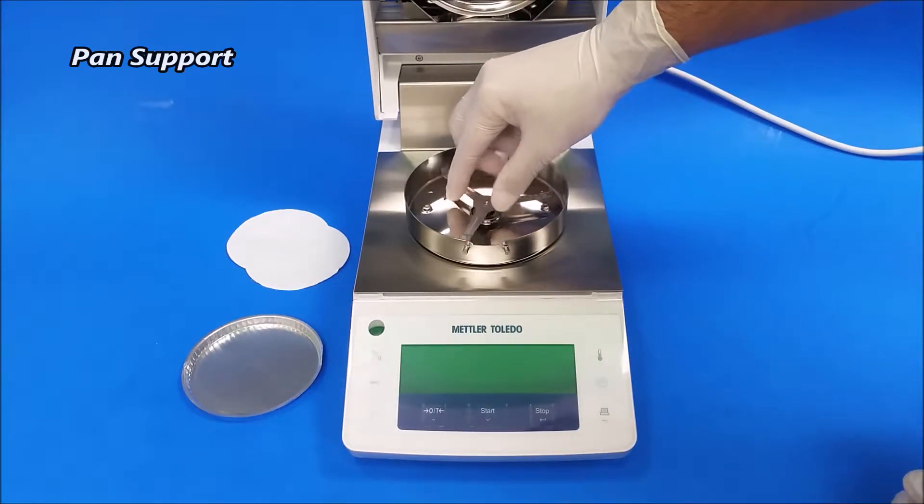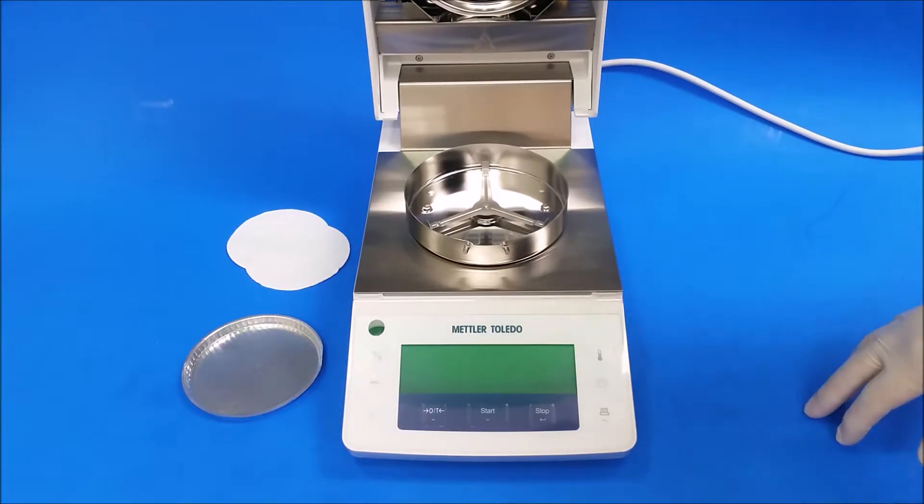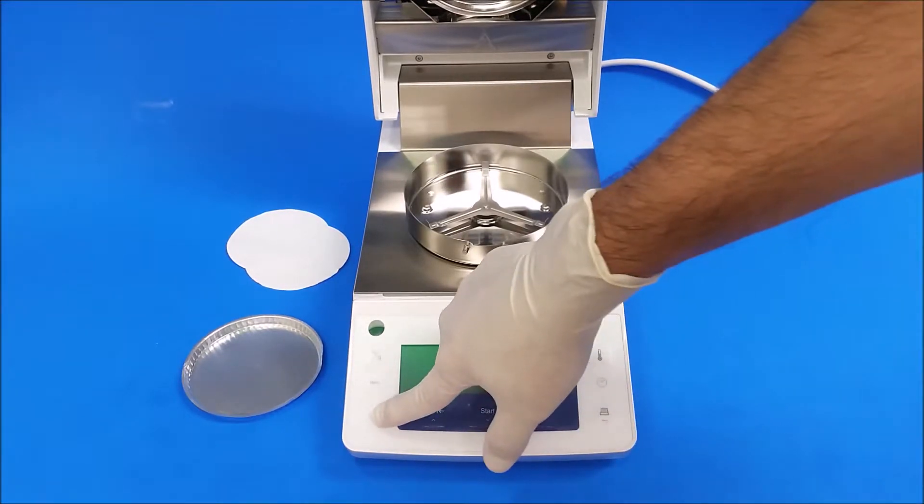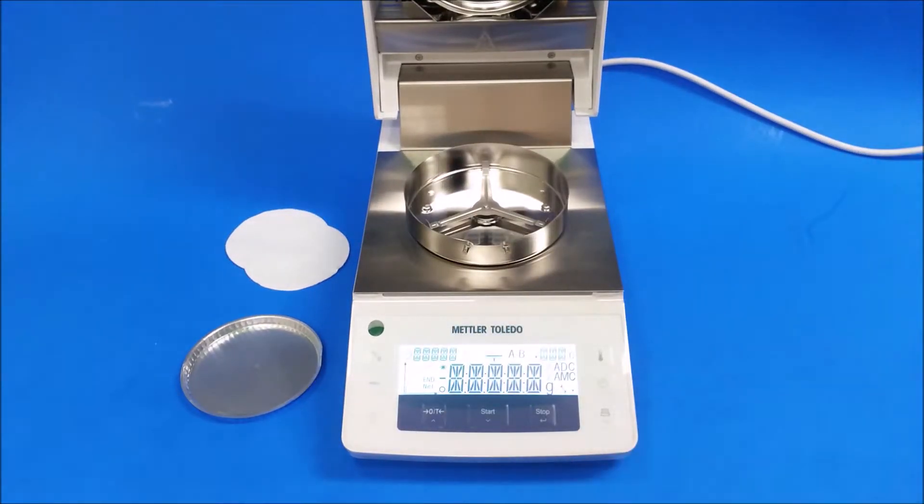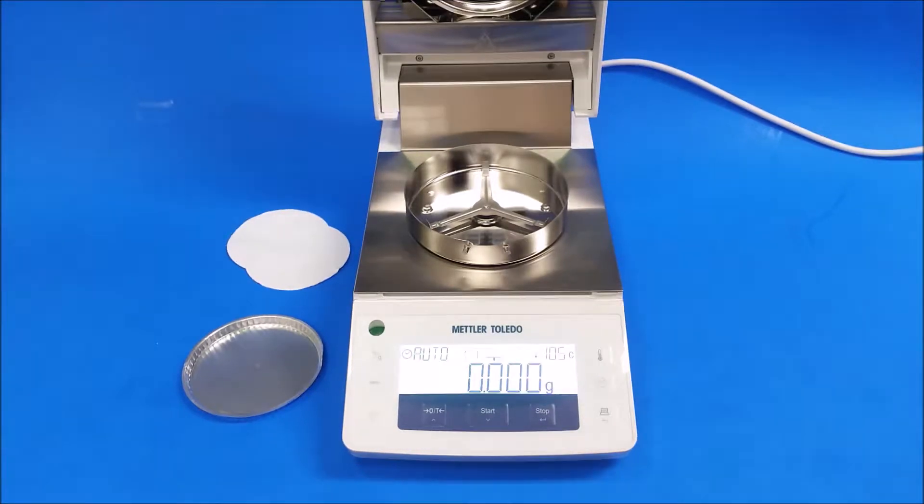And now we turn on our unit. Now the next step is I'm going to set the test parameter settings to my standard solution. It's really simple, it's already on auto, so all I got to do is just change the temp.